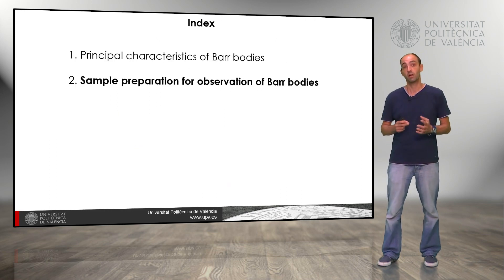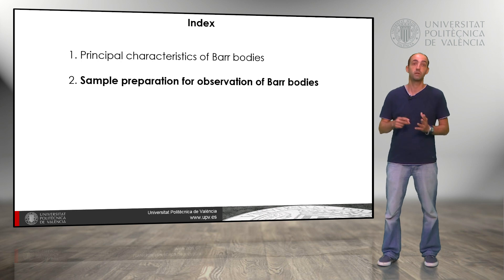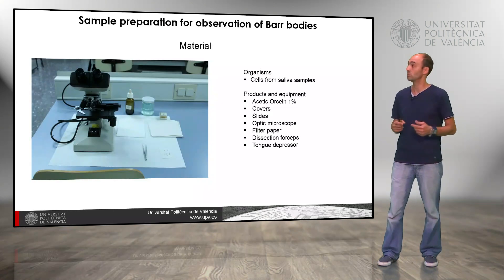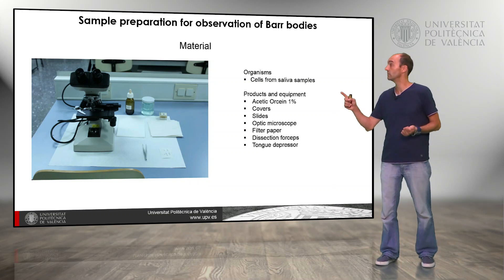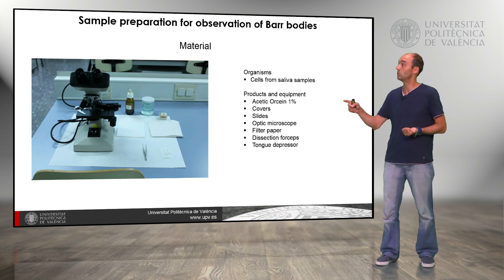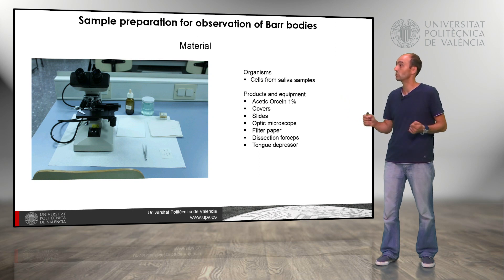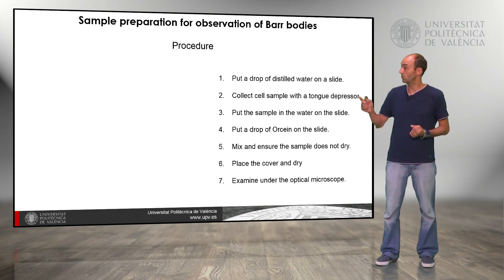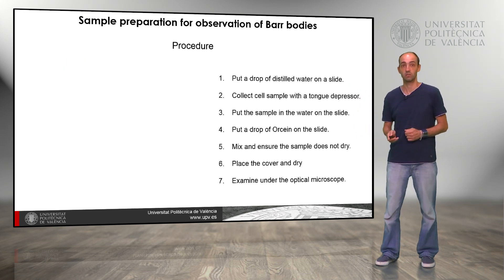Now we are going to see how to prepare the samples for observation of bar bodies at the laboratory. We need some equipment: we need cells — in this case we are going to use cells from saliva. We also need orcein stain, coverslips, slides, a microscope, filter paper, forceps, and a tongue depressor. We are going to follow the steps that we will explain in detail.